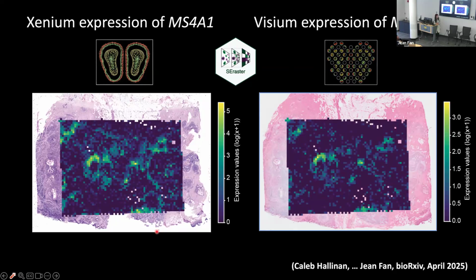Yeah, the gaps in the visibility. Great question. In this case, we aggregated, I actually wonder if he did consider it. We know exactly where the Visium spots are, and we're assuming a 55 micron round circle. So then we can aggregate the Xenium to the same circles to enable a fair comparison. There are empty gaps between.